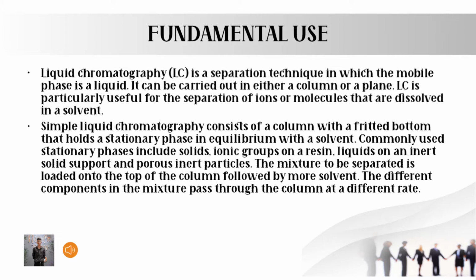Fundamental use of liquid chromatography. Liquid chromatography, or LC, is a separation technique in which the mobile phase is a liquid. It can be carried out in either a column or a plane. LC is particularly useful for the separation of ions or molecules that are dissolved in a solvent.